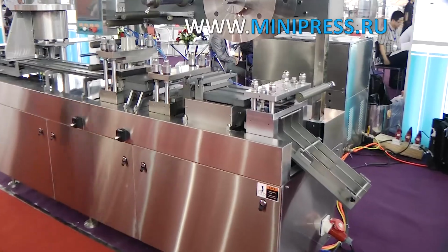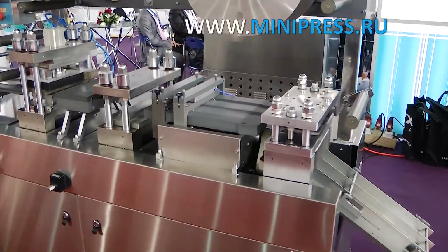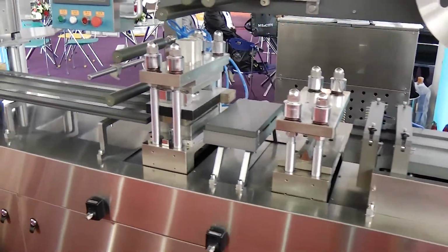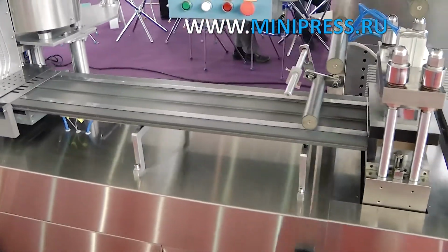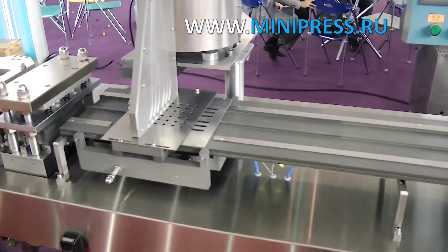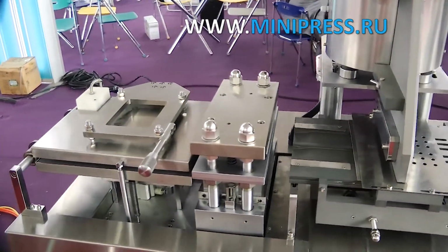There is a lot of equipment on the market. Many processes have changed and become automated. In pharmaceutical production, it is very important to control the quality of raw materials and finished drugs. In production, they check the moisture level, melting time, transparency. To ensure that the tablets fully complied with the requirements of hygiene, it was necessary to have a serious approach to the choice of equipment.